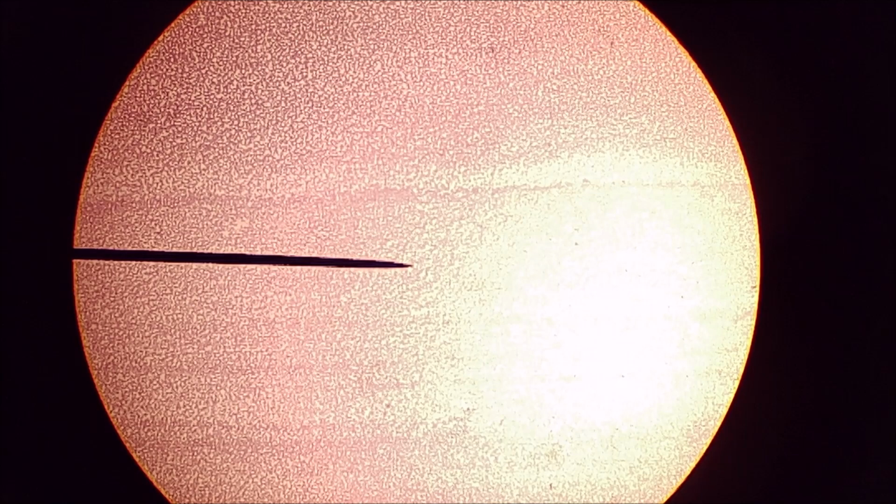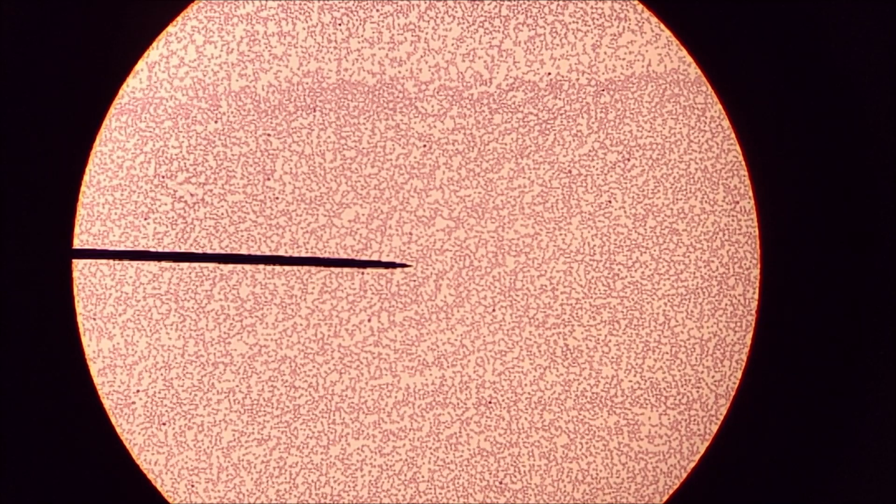Alright, what we have here is blood, folks. And I do this to you on purpose. It probably looks like a whole bunch of nothing on this particular view that you're getting right now. And I want you to see this because I want you to see just how small your red blood cells actually are. We're at 4-times magnification right now, so we're going to go up to 10 times. All right, there's 10 times.